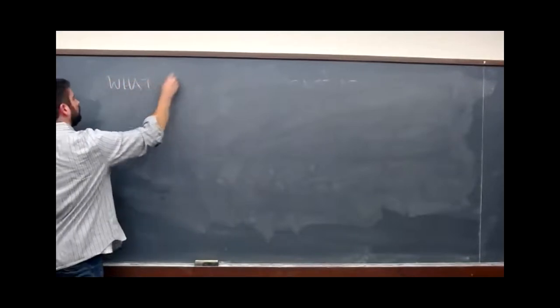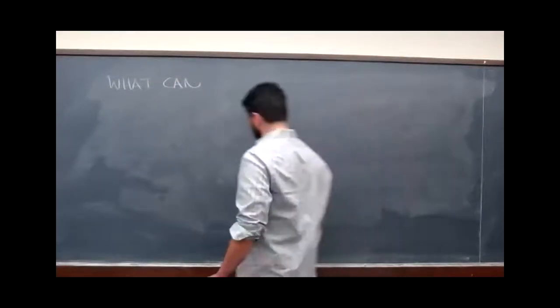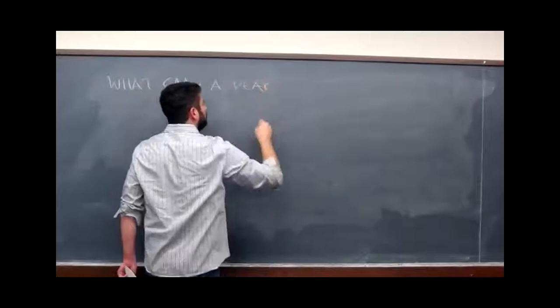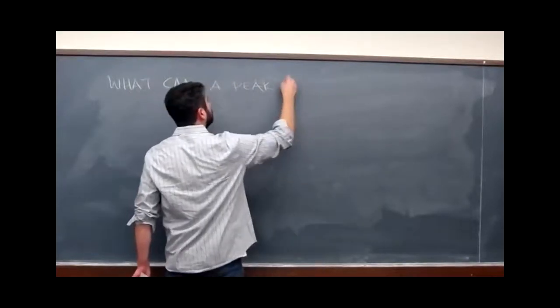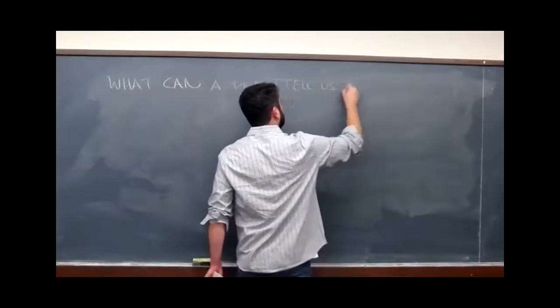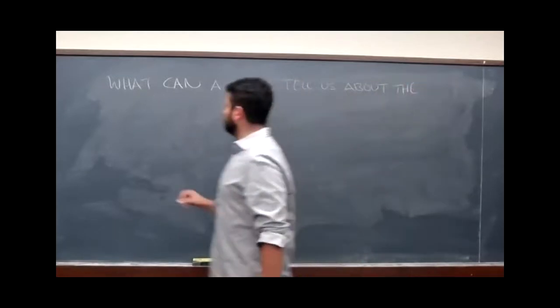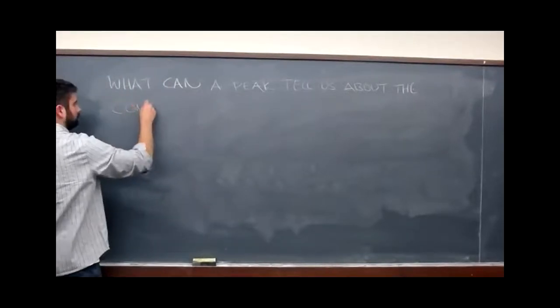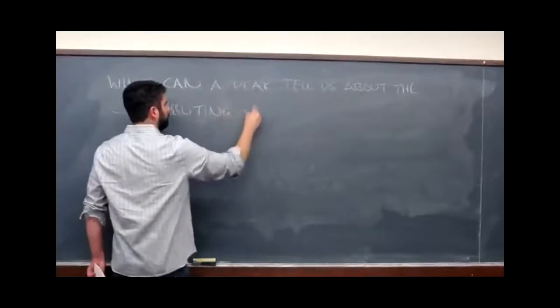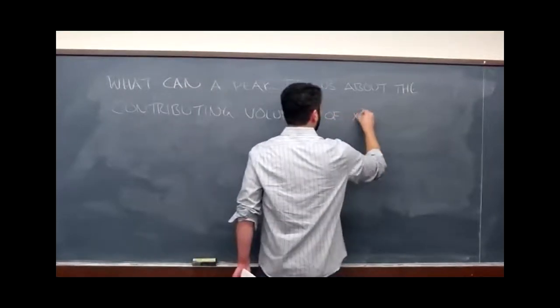So what can a peak from our integrated wedge tell us about the contributing volumes of crystal?